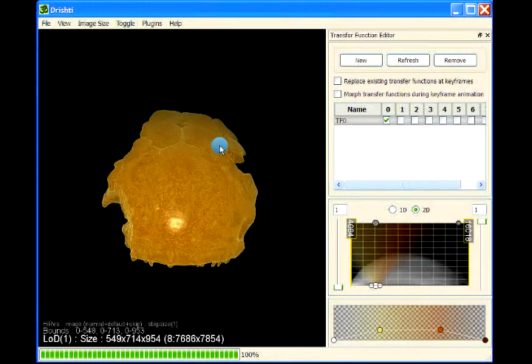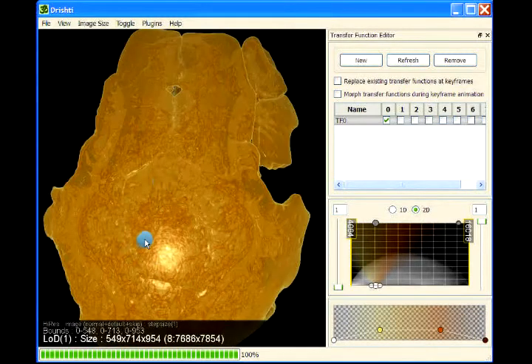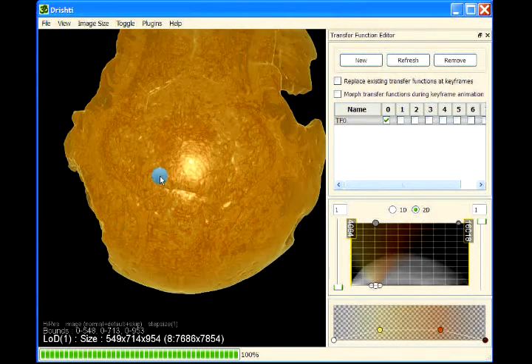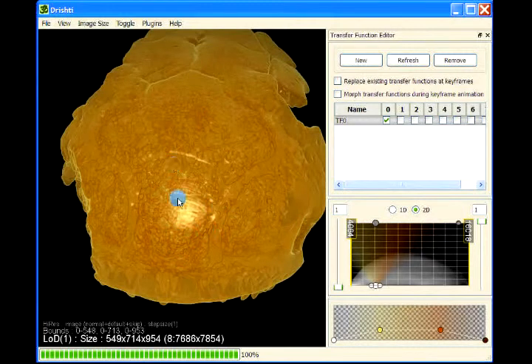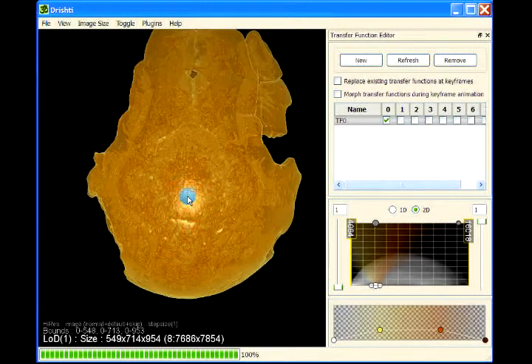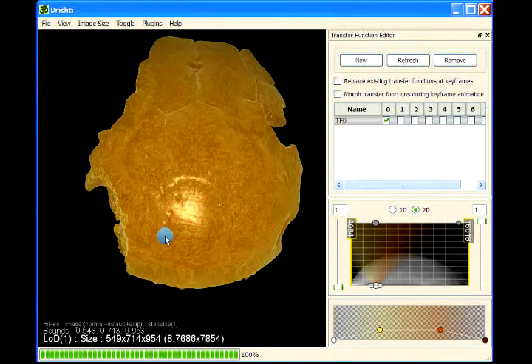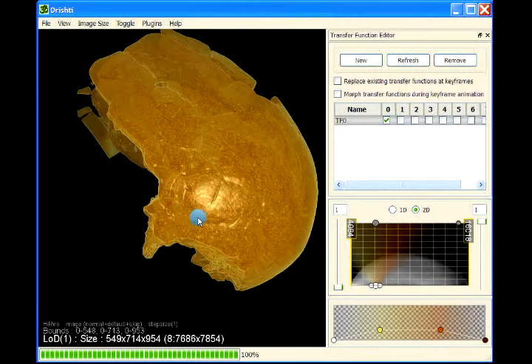In this video we will see how to extract the sensory canals in this lungfish fossil, Gononasus lungfish fossil. I got this dataset from Gavin Young here at the Australian National University. So what we would like to do is now extract these sensory canals.